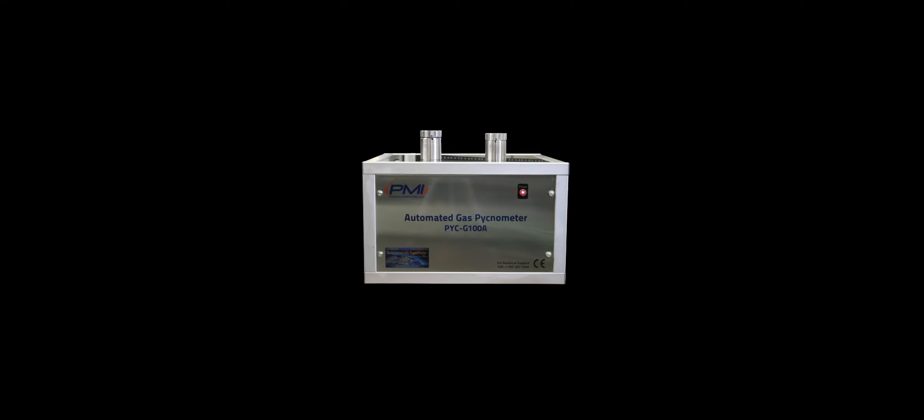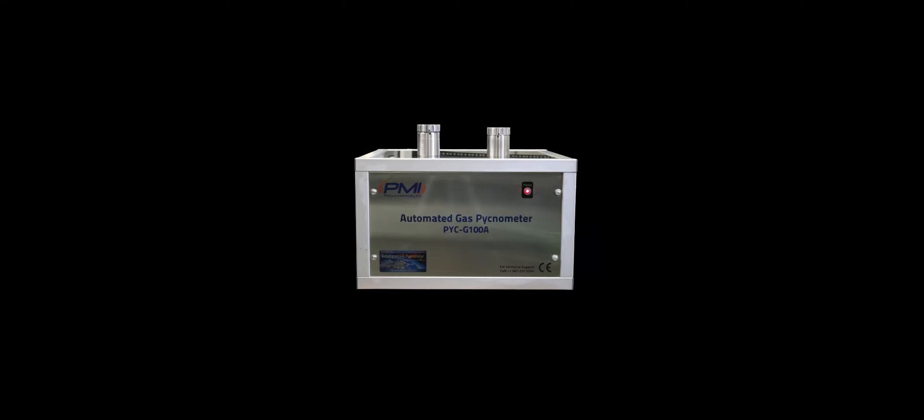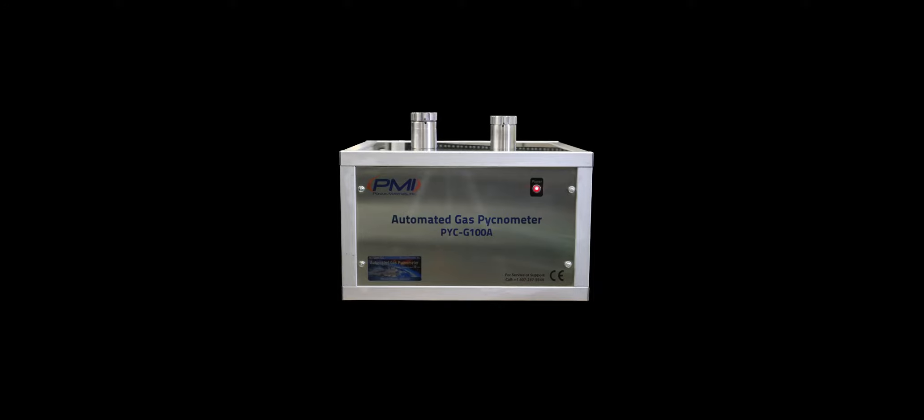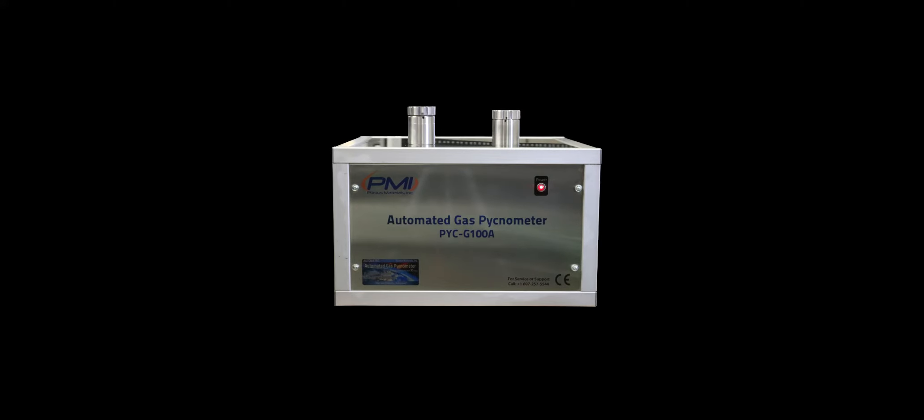This is the PMI gas pycnometer PYCG100A. It provides reliable measure of absolute density and absolute volume of powders and bulk solids using high-precision volume measurements and density calculations.